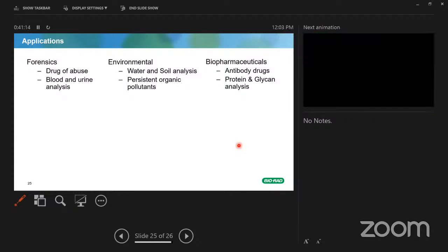Now, if you go to biopharmaceuticals or any pharmaceuticals, there would be at least 10 to 100 instruments, from small to high, just sitting in one unit, and they are testing the compounds on a day-to-day basis. For example, each batch they test, for instance, stability studies.